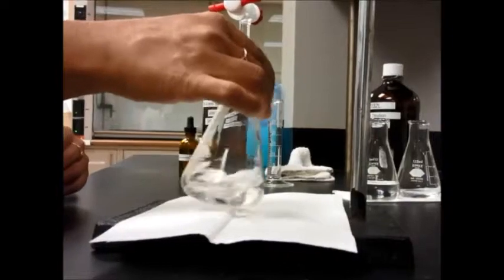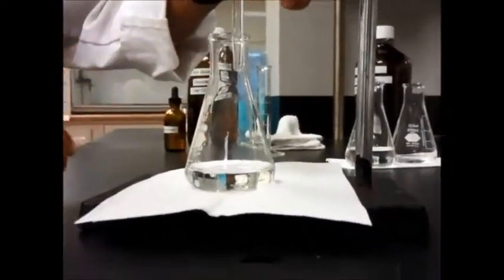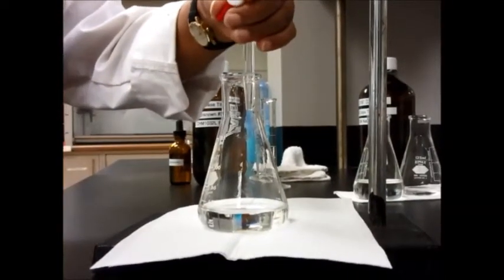You can see it's already turning a little bit pink, which means it's getting close to the endpoint. But of course the color disappeared when you shook it.